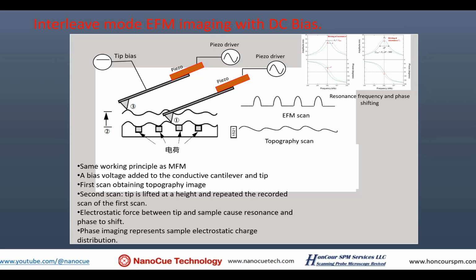And then your tip scans the sample twice. First time on the surface to image topography. Second time with a lift separation distance. So the tip glides over the sample and then records the attractive repulsive force from the phase image. Straightforward. Now, this straightforward imaging mode works very well until you reach its limitation, which is that it does not detect charge that's very, very small.